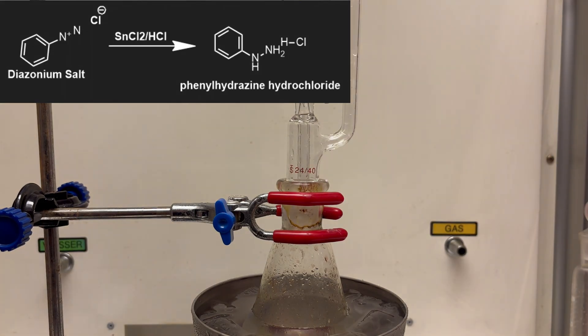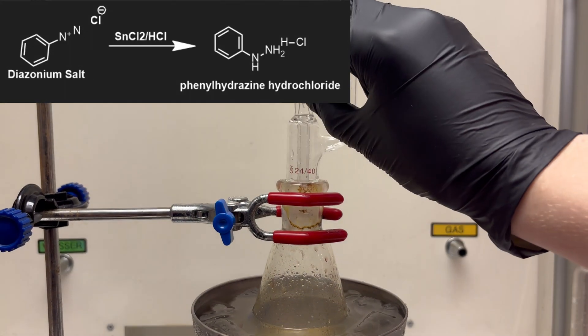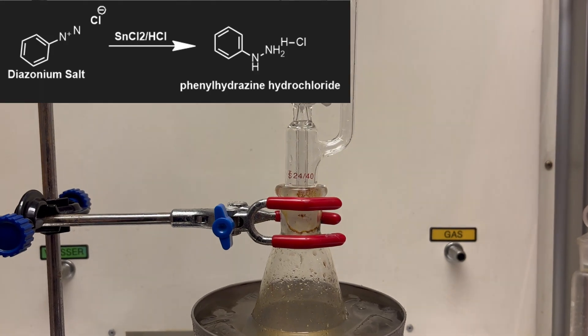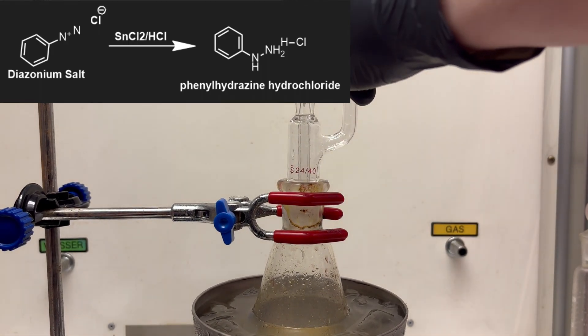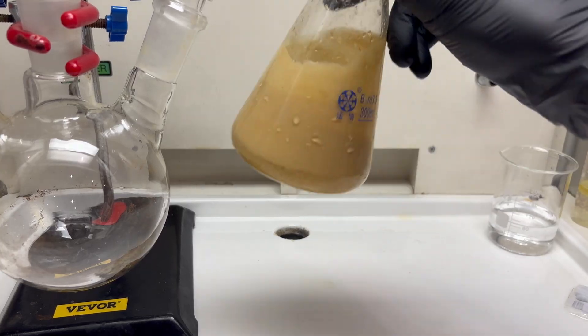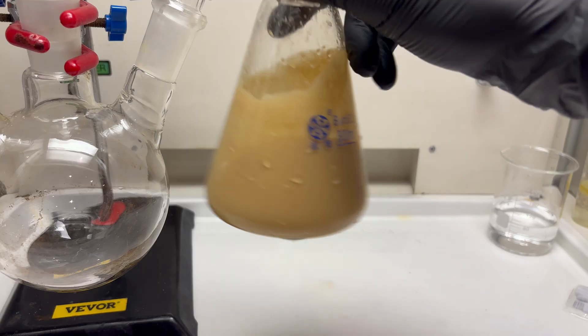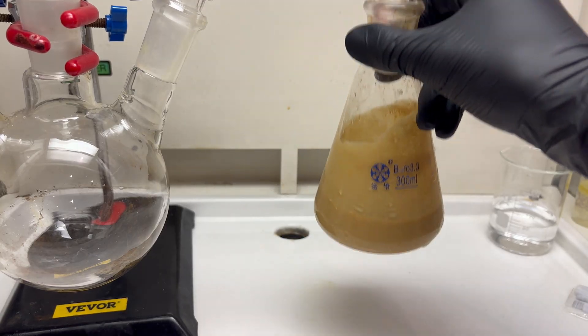The stannous chloride solution reacts with the diazonium salt of aniline to form the insoluble phenylhydrazine hydrochloride. After this reaction, I shake the flask a bit and you can see the insoluble phenylhydrazine hydrochloride.